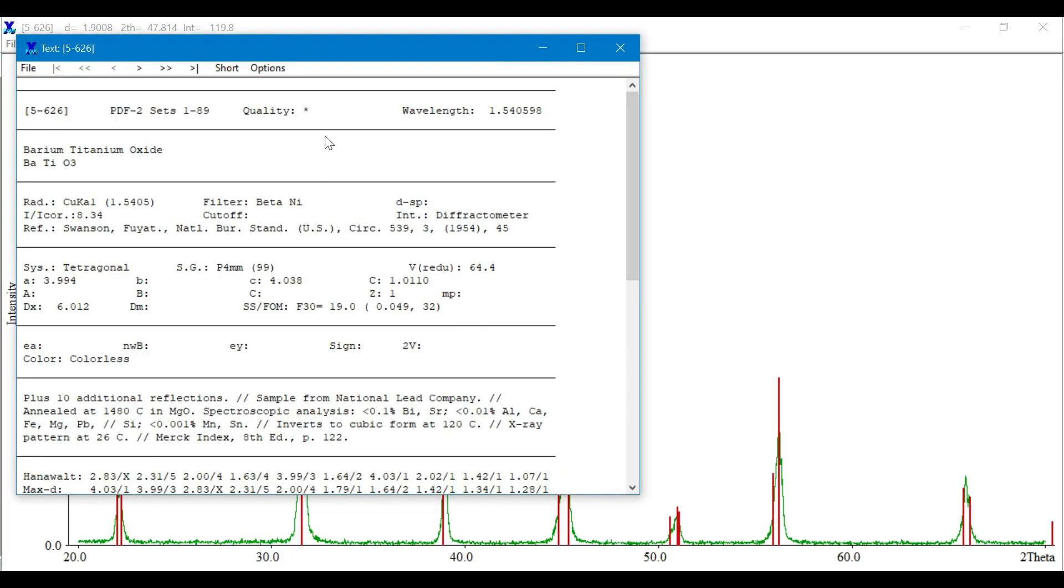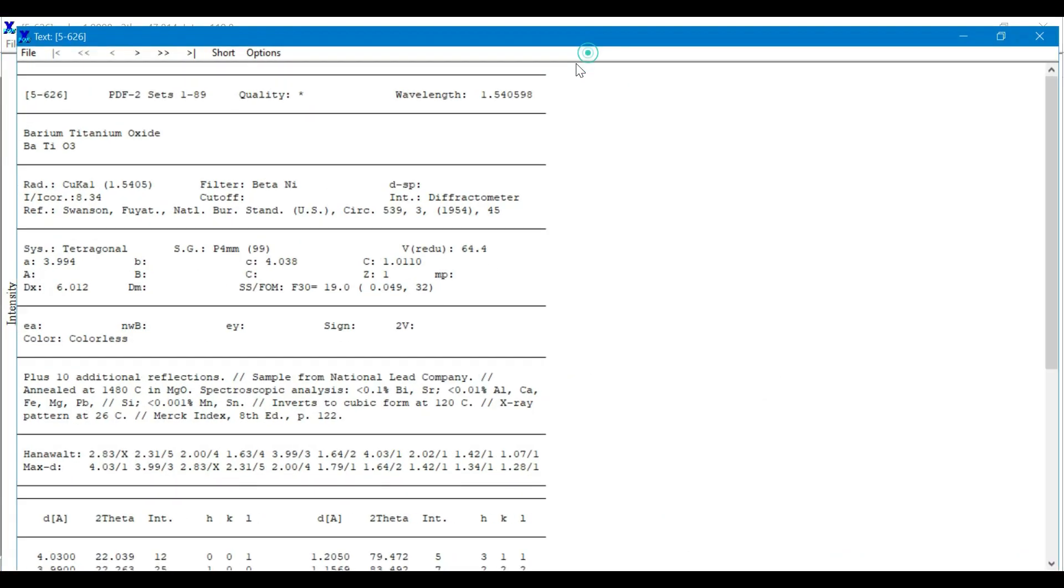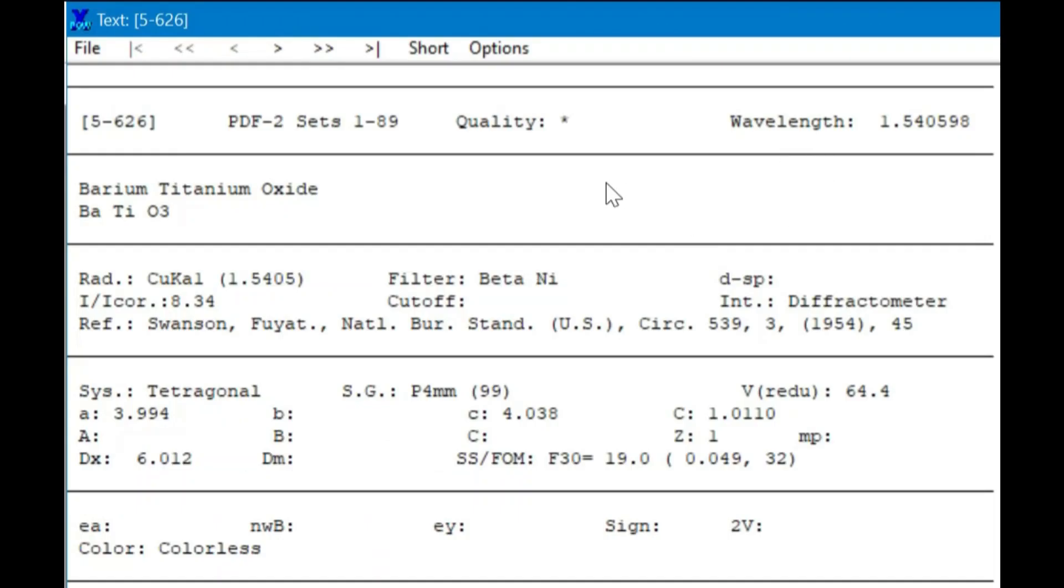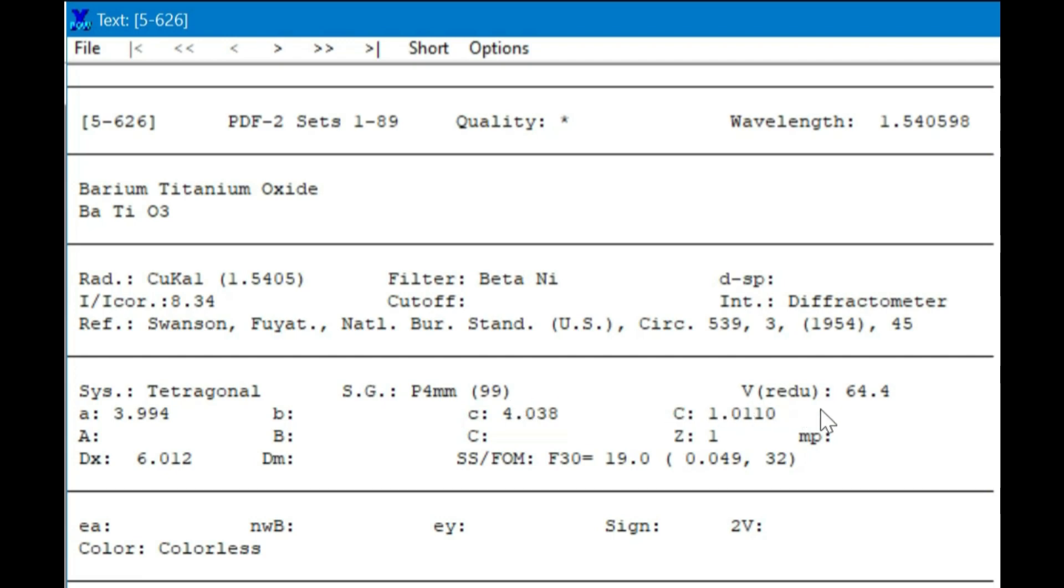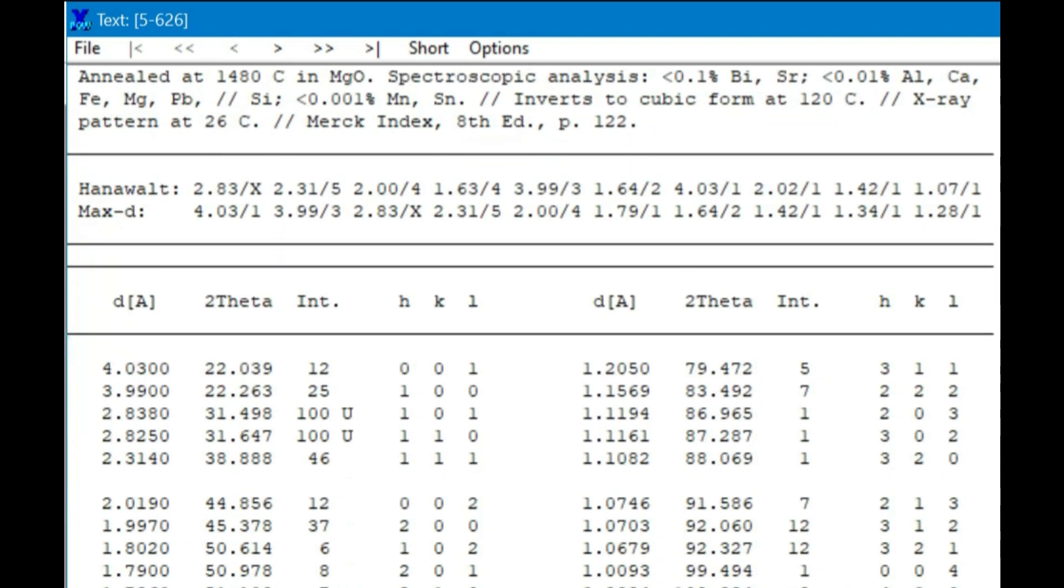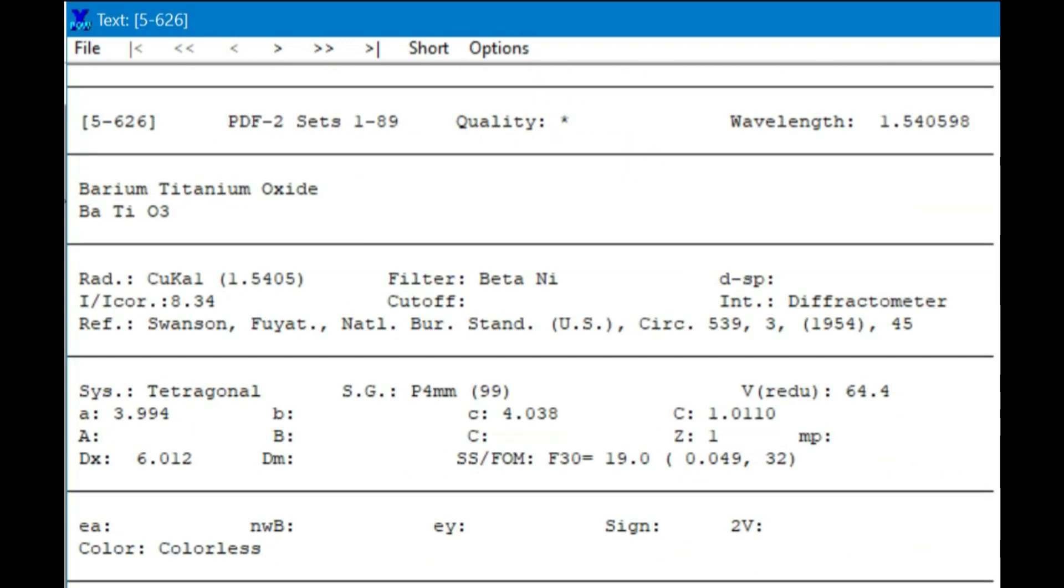You may also open the card details. Here I have opened that file. You can see that copper radiations were used to collect this data. It has a tetragonal structure given here, this is the space group, and these are the lattice parameters of this compound. At the bottom, the different planes are given. The DX term denotes the theoretical density of the material.